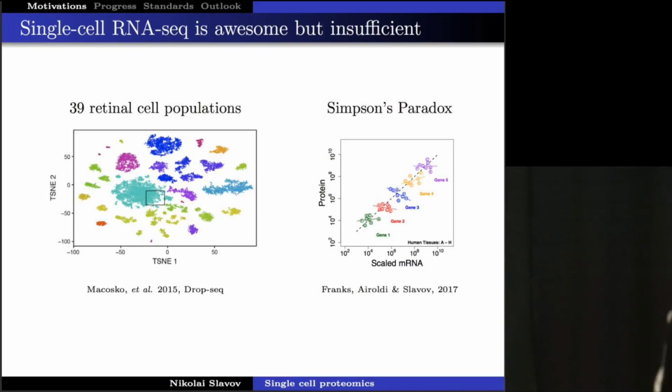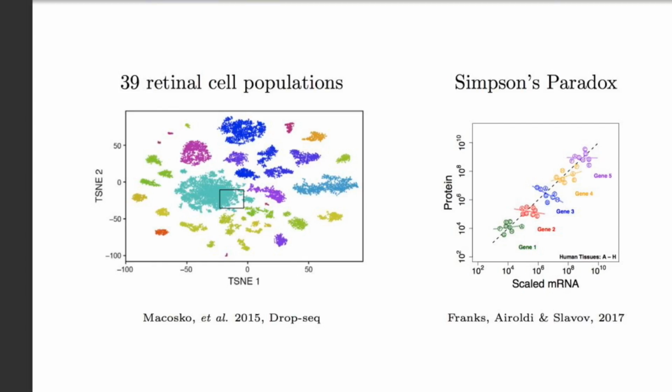So I'm inspired by that picture. And that's what I want to be able to do with single-cell proteomics. I would love to be able to quantify the proteomes of tens of thousands, maybe 50,000 single cells.